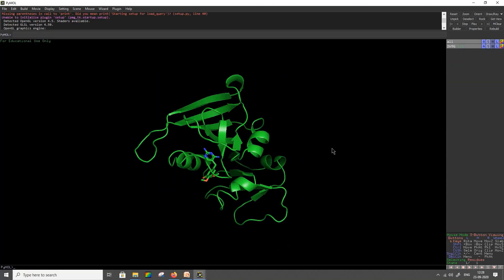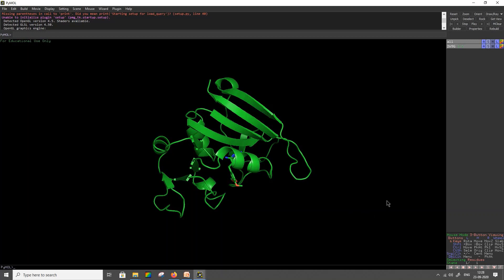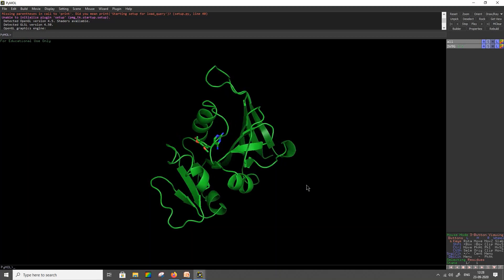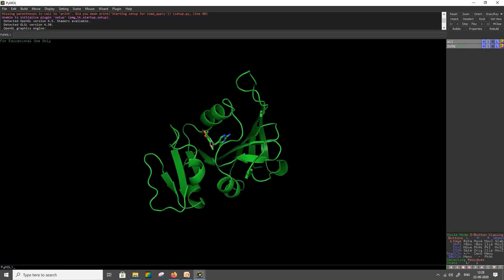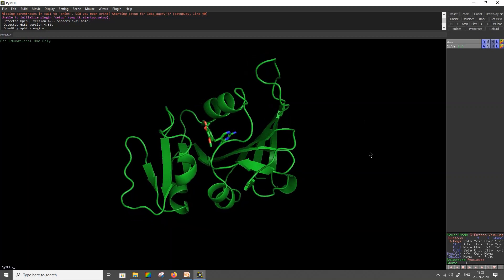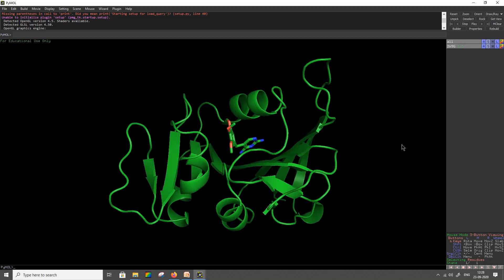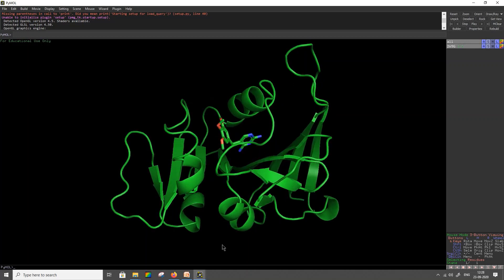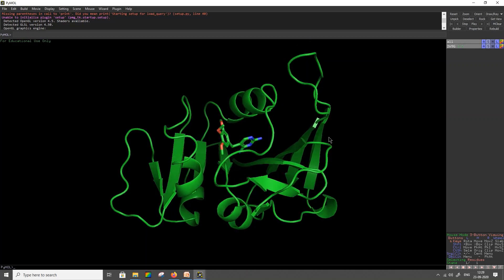I have downloaded a protein molecule from the PDB website which is 2W9G. This particular structure has the DHFR enzyme with the trimethoprim molecule embedded in it as a co-crystallized ligand. Prior to analysis, I have already removed all the water molecules and other co-factors that were co-crystallized in this structure. Hence, I have retained only the trimethoprim molecule and the protein structure for ease of analysis.